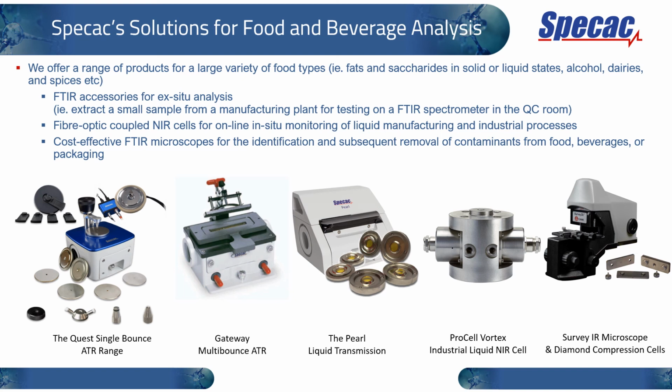And these are deemed to be ex situ analysis at times, because what I mean here is that instead of analysing your product in the pipework of an industrial plant, very often you're extracting small samples from the manufacturing plant for testing in a QC room separate to the manufacturing plant, where you normally place your FTIR spectrometer.